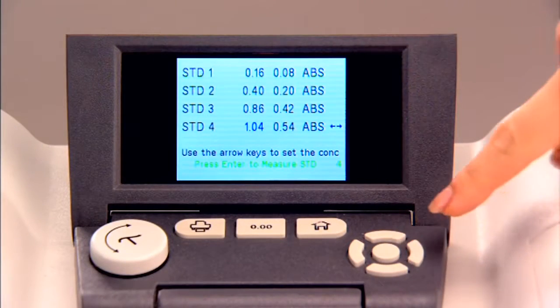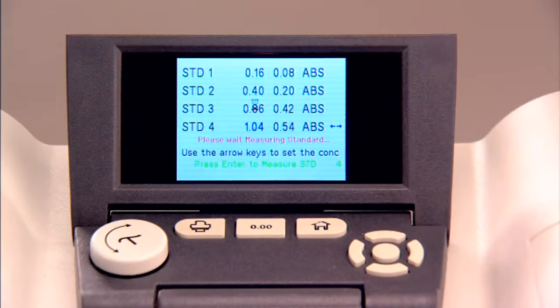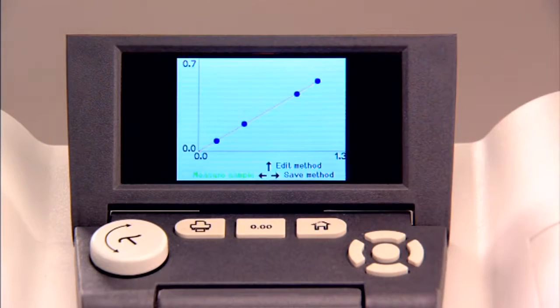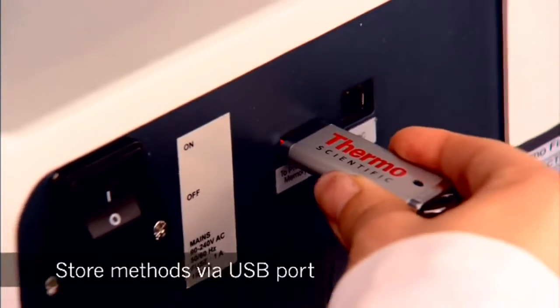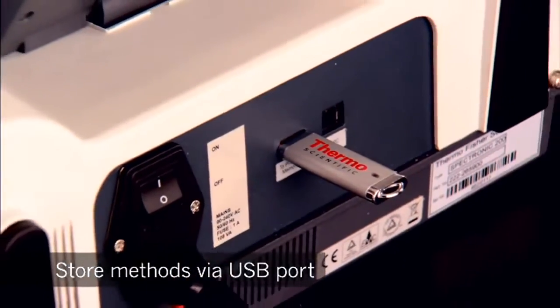Set up a quantitative method with a user-entered factor or up to four standards to make a Beer's Law plot. You can even store your methods to a memory stick via the USB port for later use.